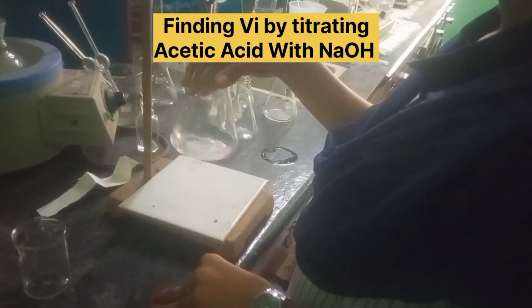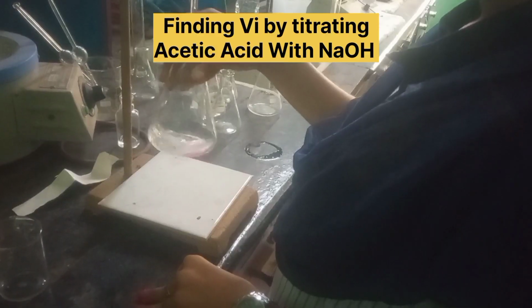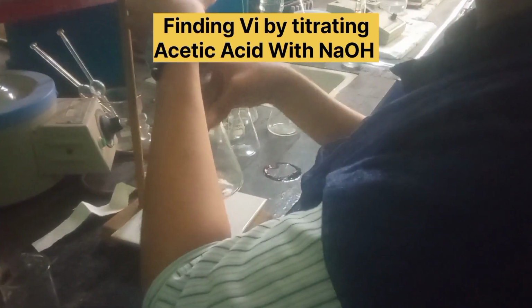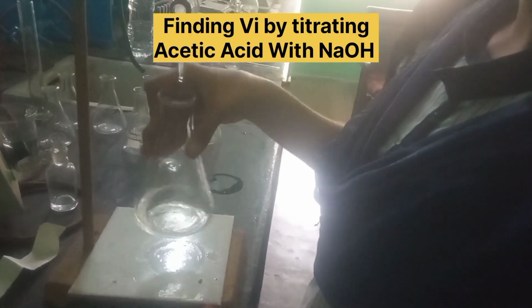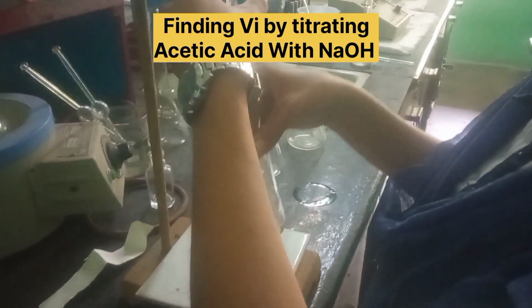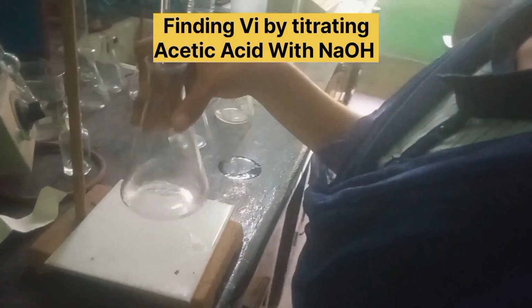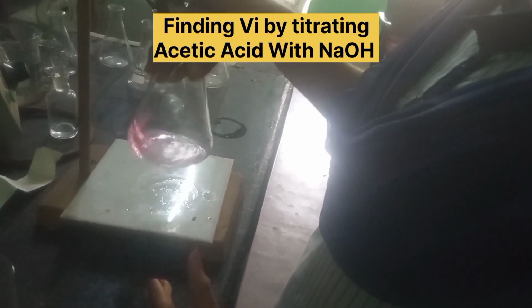By keeping this value aside, one has to titrate the acetic acid filtered from the numbered standard flasks containing charcoal. 10 ml of acetic acid is to be taken from each flask. That means, previously it was filtered into boiling test tubes. So now the standardization is still going on.